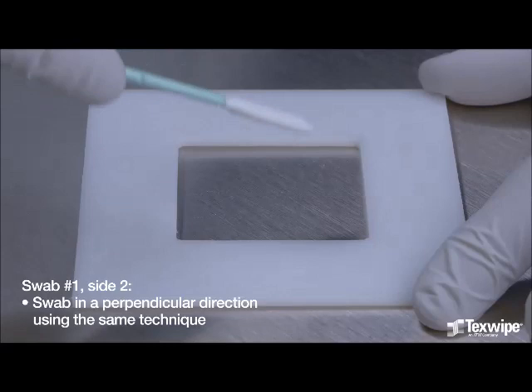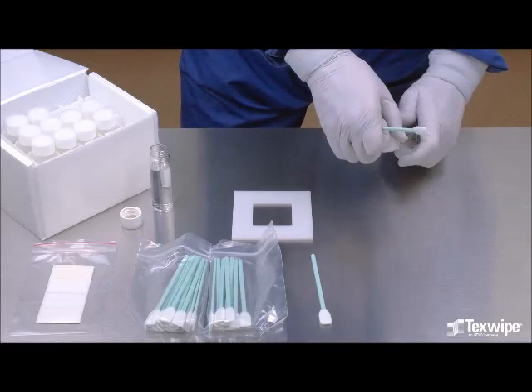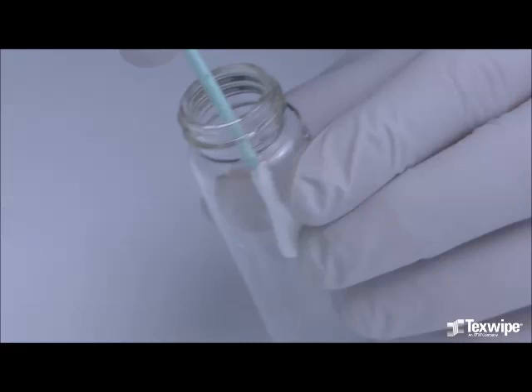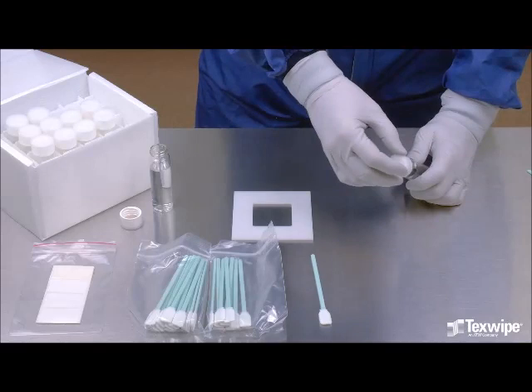Flip the swab over and swab in a perpendicular direction using the same technique. Keep the entire swab head flat against the testing surface. This is the second side of the first swab. To snap the head into the vial, insert the swab head into the vial, place the notch of the handle on the vial's edge, and push the handle down until the handle snaps and the head falls into the vial. Place the cap on the vial.